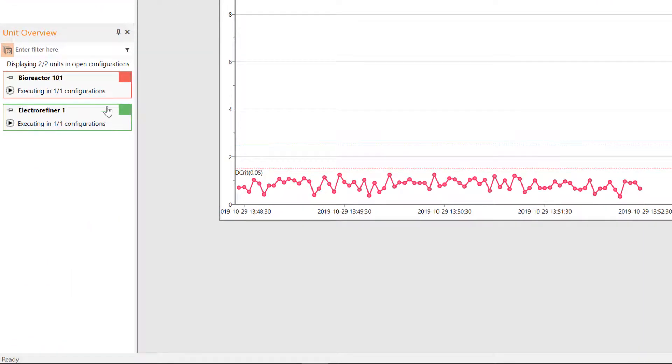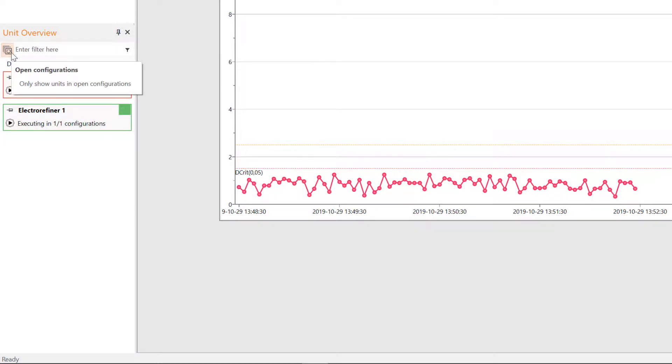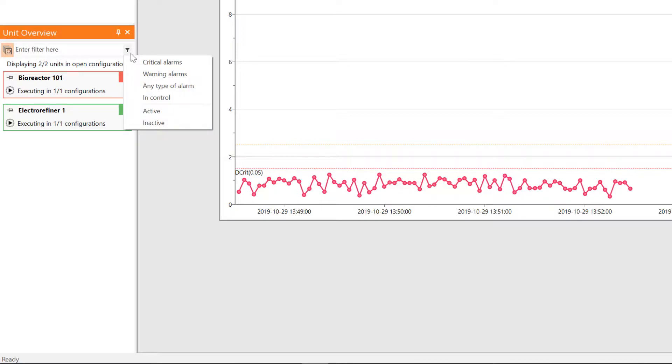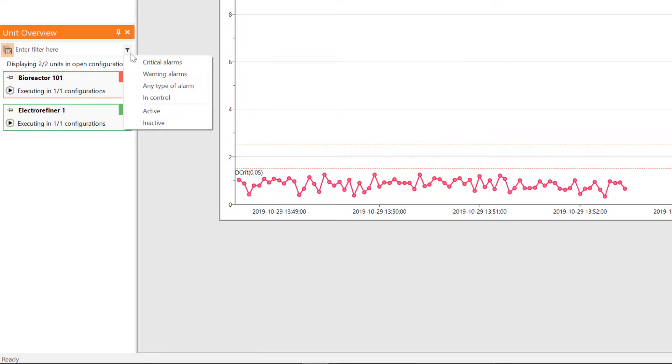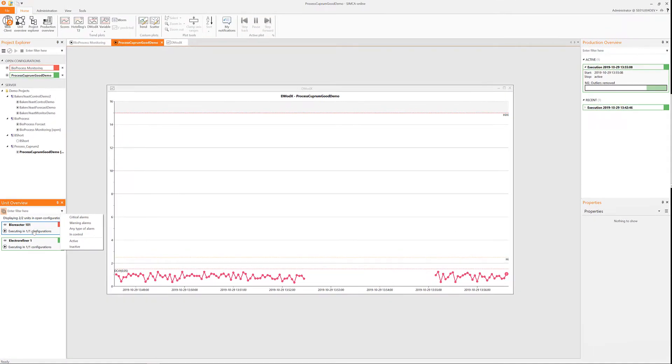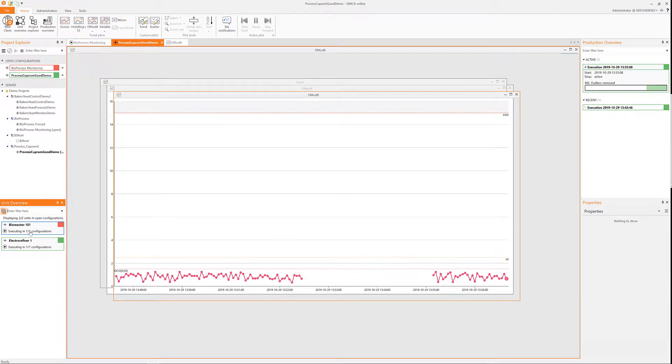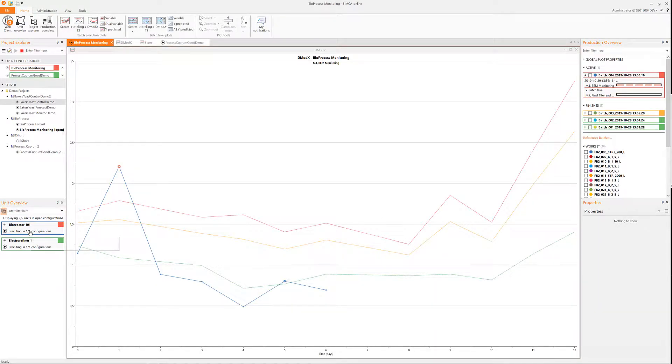Another way to start using the system is to monitor your configured units. There is a button that pre-filters all units to the ones in the open configurations only. And this pre-filter can then be combined with the secondary filter.